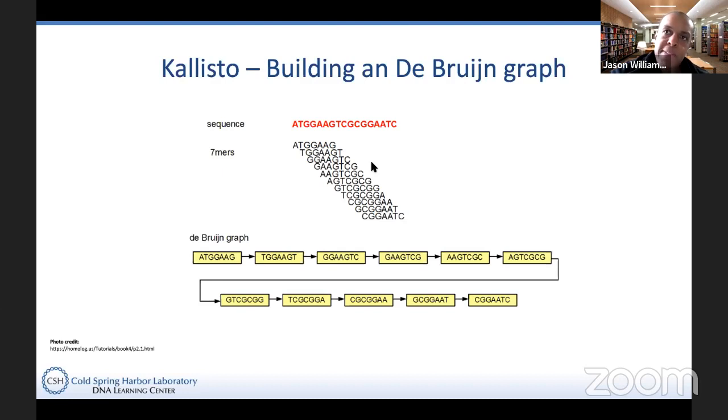But when you're working with sequences, in our case, DNA sequences, it works that you chop them up into these overlapping pieces, and each chunk, or each piece, which we call a k-mer, if you choose a particular number for K, like 7, then it's called a 7-mer, or if you chose 8, it would be an 8-mer. Well, actually, it would always be an odd number. We do that for a reason. But you chop it up, and then you say that this piece is connected to this piece, is connected to this piece, and so on and so forth. And you get this thing called a graph.